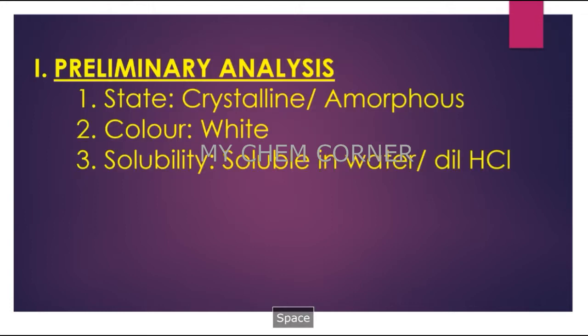Now let's see how to do the preliminary analysis. When you write preliminary analysis, the three things that you look at are state, color and solubility. Now the state of the salt is either crystalline or amorphous, and I told you how to detect it. You always have to take a pinch of salt to find out whether it is crystalline or amorphous.